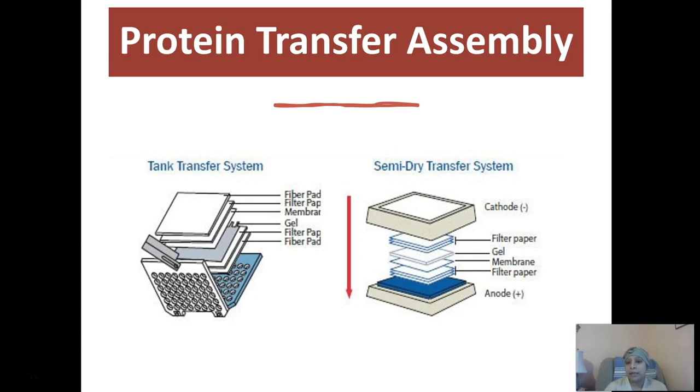There are two different methods that people use. There are the tank transfer system and a semi-dry transfer system. I'm going to show you examples of both, and then I'm also going to show you what is different maybe in the setup. The biggest difference in the semi-dry transfer is the minimal requirement of the buffer. There's very little buffer needed in there. The tank transfer system is going to use a lot more buffer in the process.